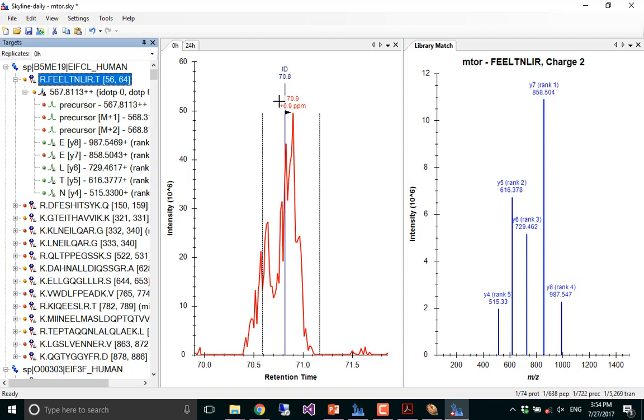I would encourage you to do that, actually, even with these files, and then take a look at what it looks like. It will frequently be picking wrong peaks just because of how complex this data is, right? The data that we're looking at here is 24 m/z wide windows, pretty wide windows, and it's extremely complex. So from this example file, using other approaches, I can detect about 60,000 peptides from it. That's a ton of peptides, right? And they're all on top of each other, because it's only a 90-minute gradient. But that said, they're still detectable out of this data set if you use the right approaches to look for them.